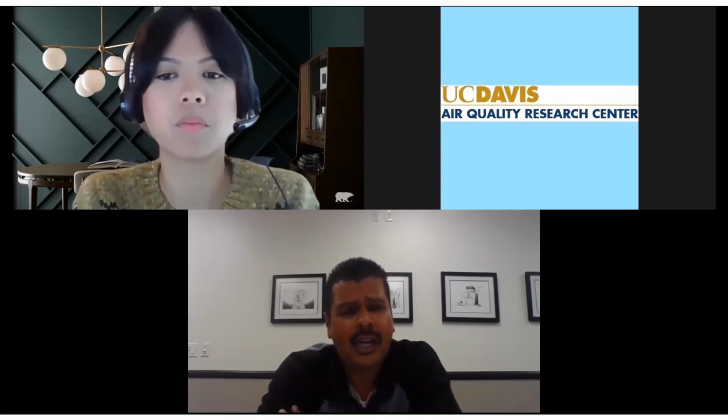But it shouldn't have any effect because your flow controller is actually the key component for maintaining your flow. As long as you have the right draw on that orifice, it should be fine. Running your checks on your flow with your flow meter with your maintenance confirms that your display flow is correct. That meets the criteria for your FEM status. So I haven't heard that, but we've been running it like that. We've been audited like that, and it's been working fine for us.